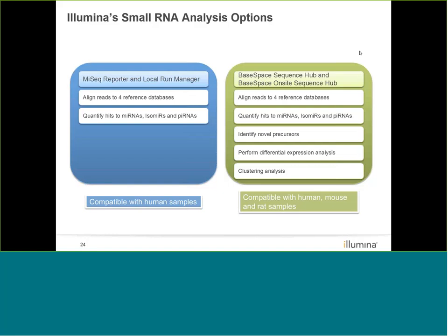samples. So the MiSeq Reporter and Local Run Manager options are compatible with human samples. The BaseSpace on-site and BaseSpace Cloud options are compatible with human, mouse, and rat samples.